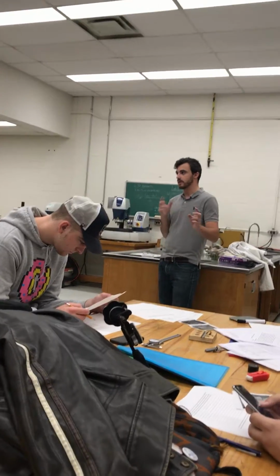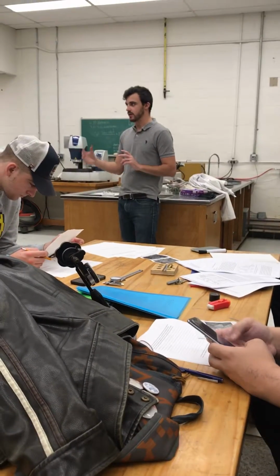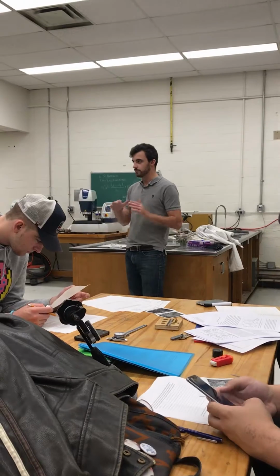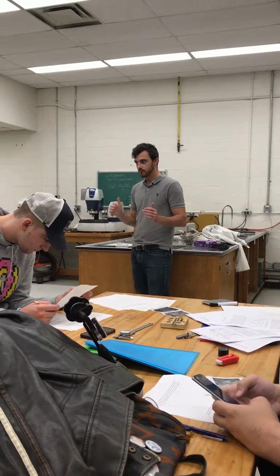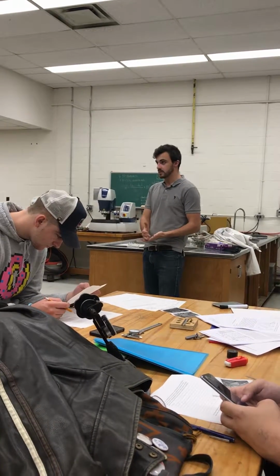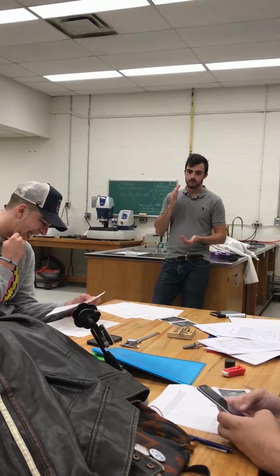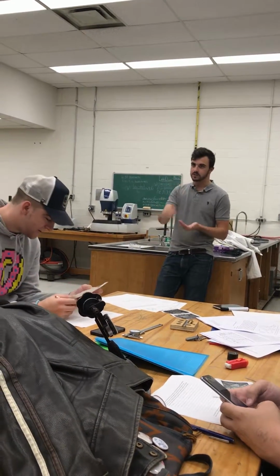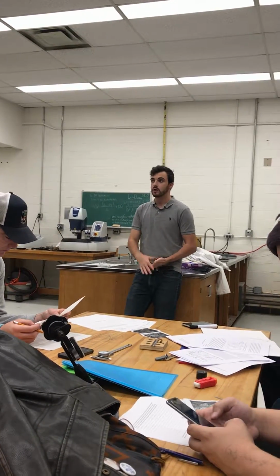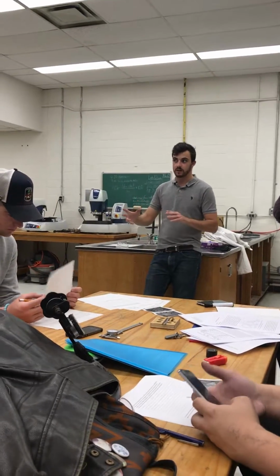Usually that's what I'd like to use, but at this point, you guys should be able to understand how to use a table to try and identify something. It's pretty straightforward, okay? So everybody's good on that? Everybody understands how I need you guys to identify the sample? Okay? So from there, you're going to identify it and reference the table. Again, make sure you reference the table, because if you don't, there's no way for me to figure out where you guys are getting that information from, okay?